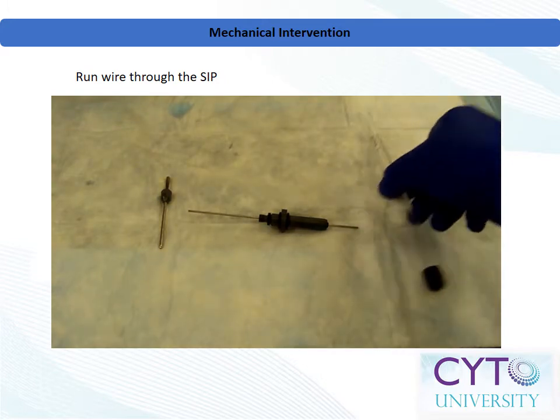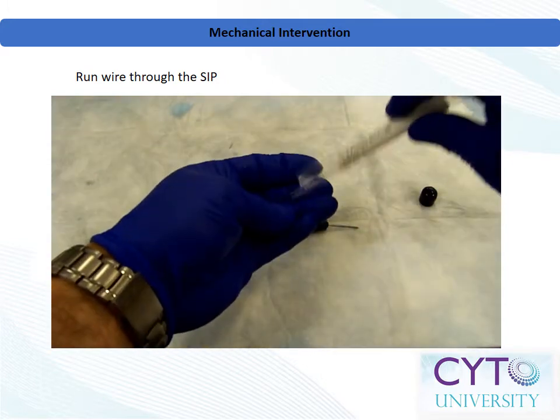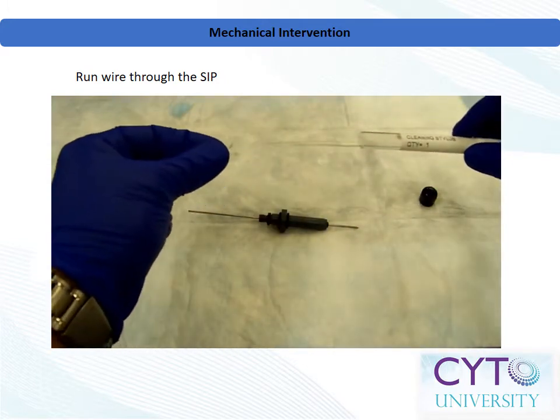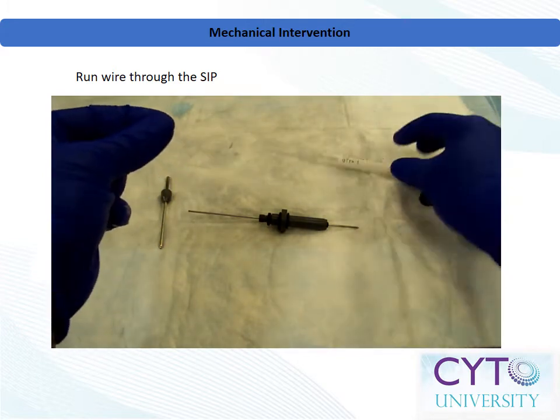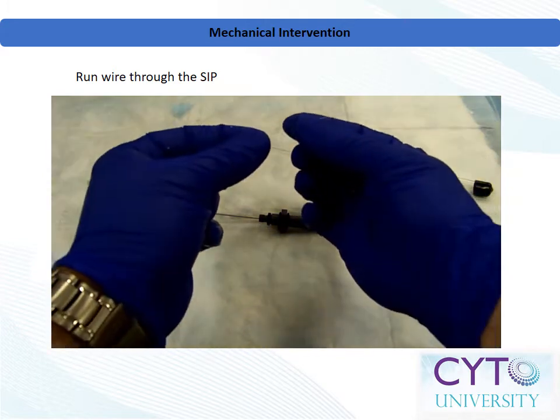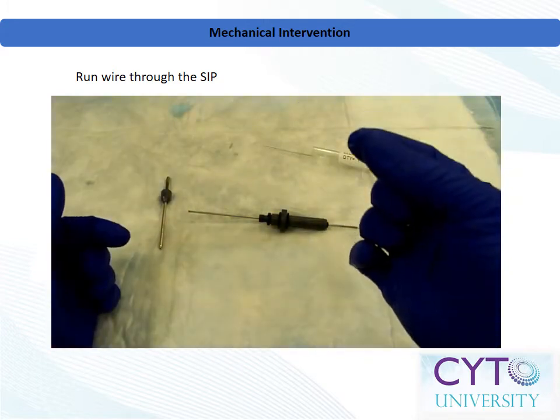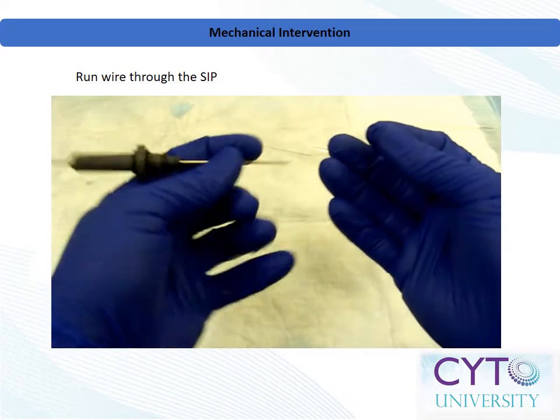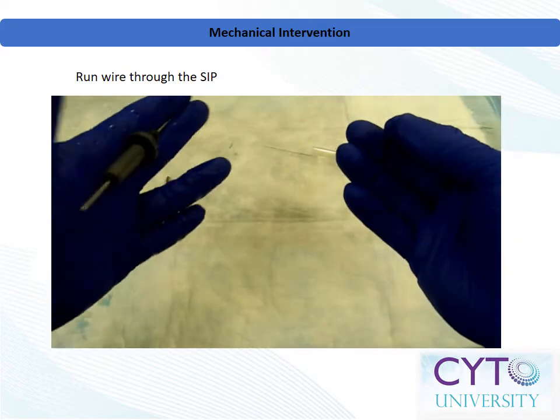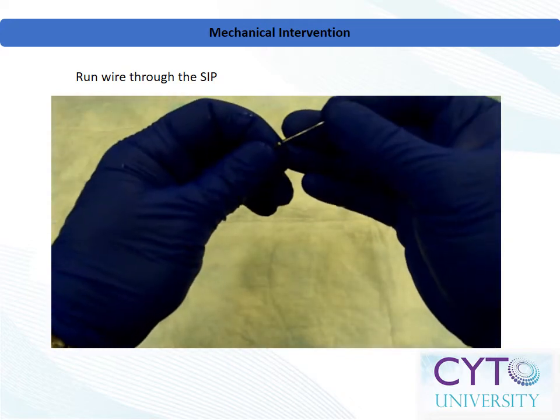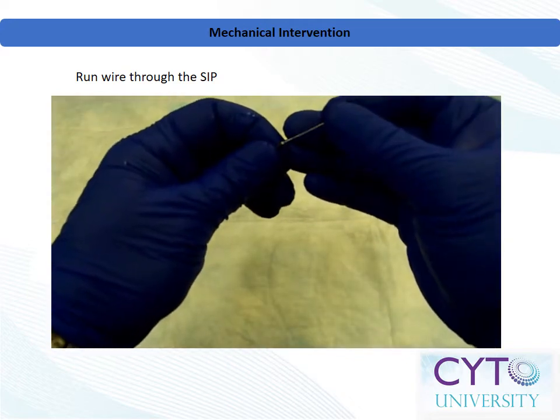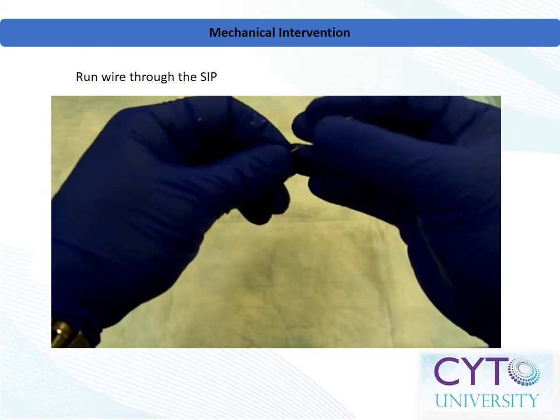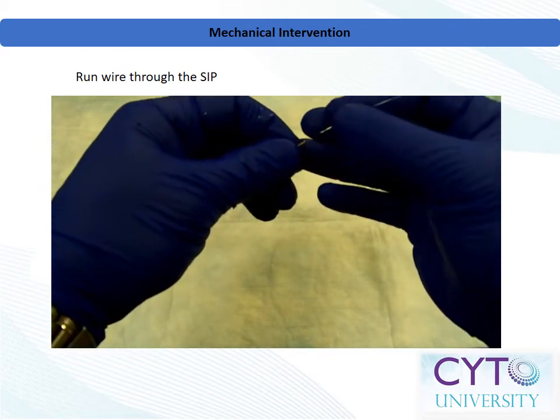As a third option, carefully run a steel stylet through the sample injection tube by inserting at the flat end and pushing in the direction of flow. Be sure the stylet does not have any bends or kinks. If you feel any resistance, immediately stop and consider using one of the two previously described methods before retrying the stylet.